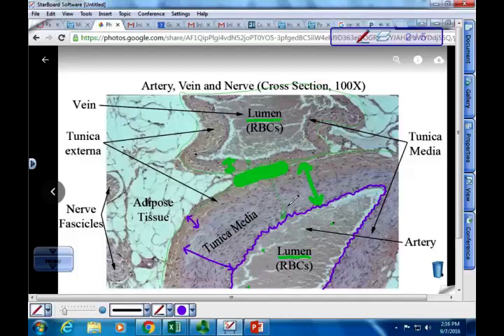And so when it's stretched out, this inner tunica intima or tunica interna is going to be straightened, right? But when it goes back to its original size, once that tidal wave passes by, it tends to wrinkle up. Okay? So in arteries, that tunica intima or tunica interna, that inner epithelial layer, will be wrinkled, okay, compared to a vein. So let's look at the vein up here.